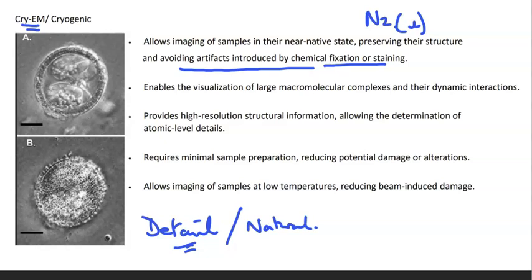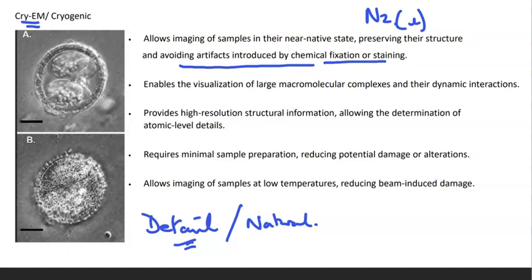So we'll be finding out and seeing examples of these different forms of electron microscopy as we work our way through the course.